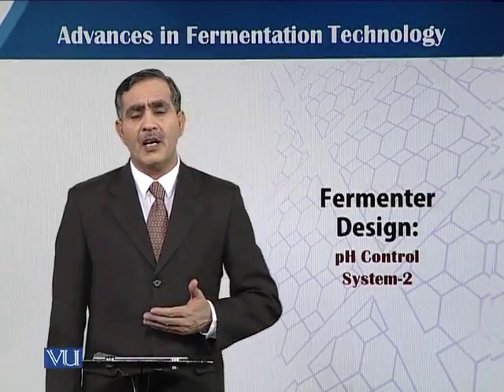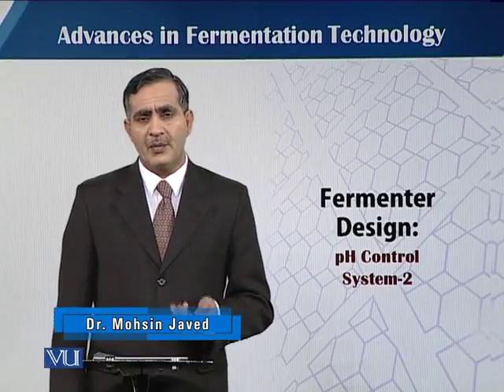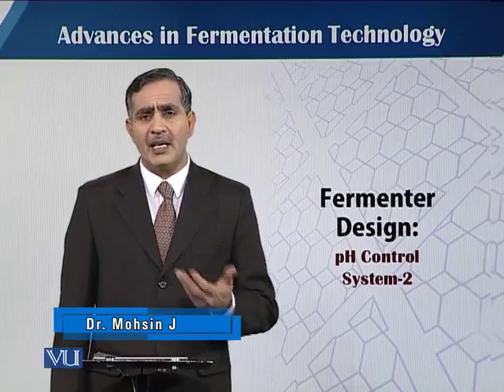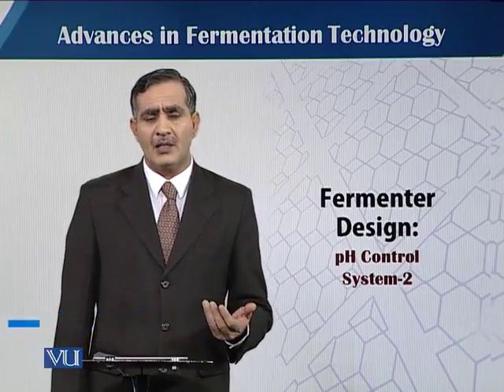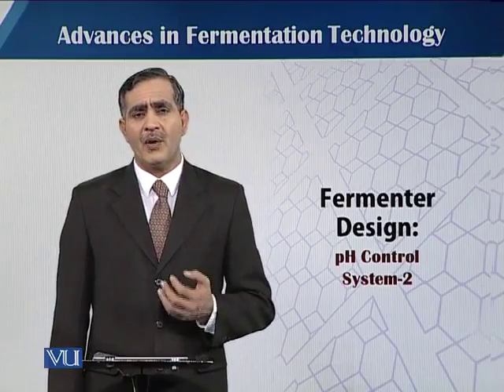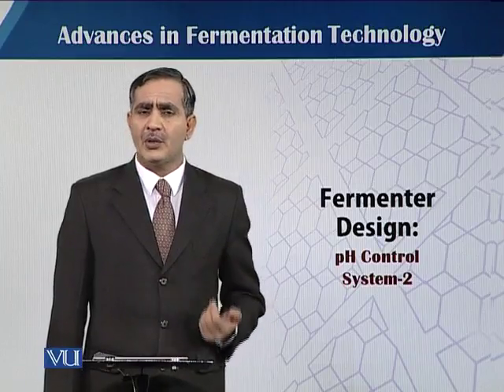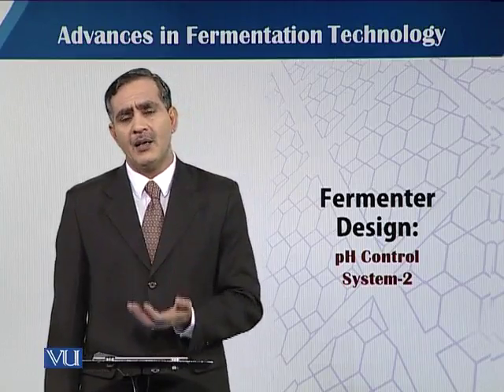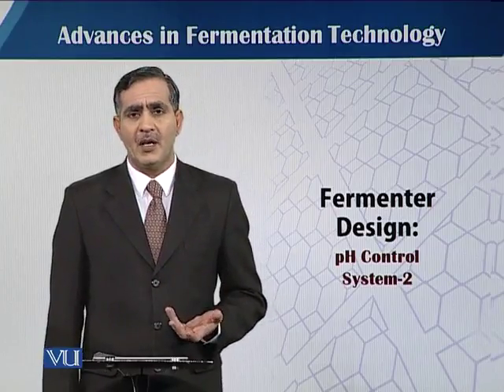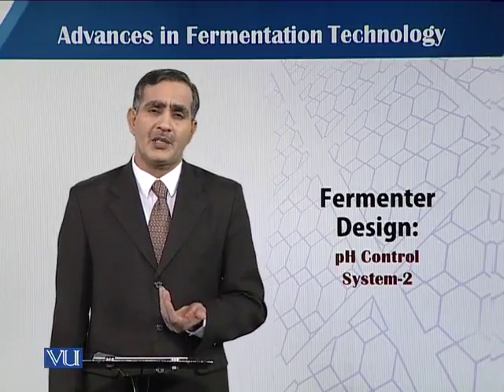In this module, we will talk about the automatic control system of pH. As we discussed in our previous module, what kind of neutralizing agent, meaning acid solution or alkali solution, they should be and what their concentration should be. We cannot use a diluted one, and we cannot use a highly concentrated material. So there is a limitation. So if we have a choice, then how do we control it with an automatic control system?